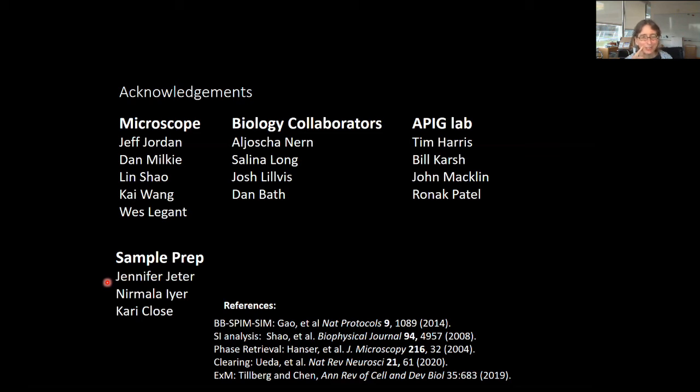It would make an interesting modeling study, and I haven't done it, so I can't give you a clean threshold. It will always boost your resolution some, because if you have a low signal to noise ratio sample, you aren't getting all of the resolution out of your original detection objective either. So if you do structured illumination, you'll always get more resolution out. It might just not be out to the theoretical limit.